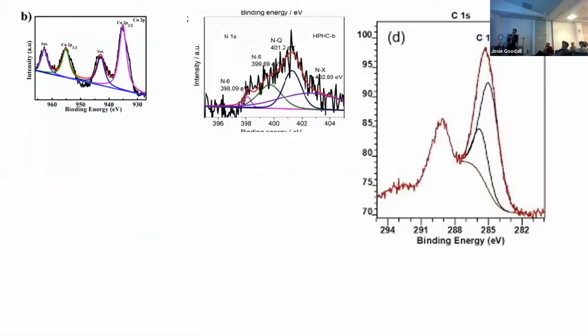So there's a few examples of terrible backgrounds here. So I'm going to start with, let's start in the top left. So the background function, as we've heard today, is a function that's supposed to account for the intensity of the XPS peak, which isn't to do with the actual core line, the photoemission, or whatever feature you're looking at. So a difficulty of XPS is often that background changes on either side of the peak. So we have to model that somehow. But what your background function shouldn't do is ever go on top of the data. So your background function can't be more than the data, because that would indicate you have negative photoemission.